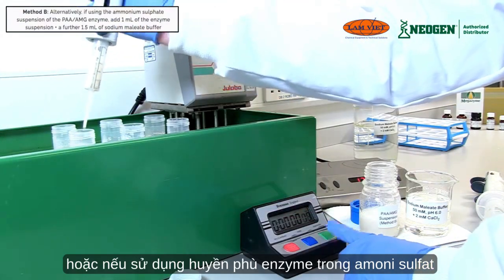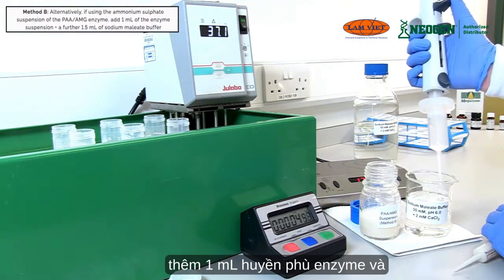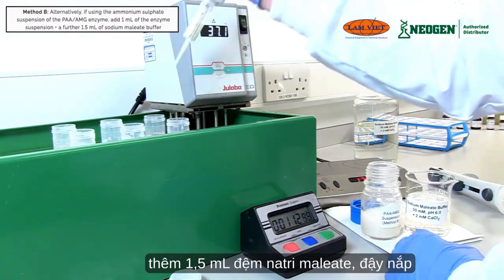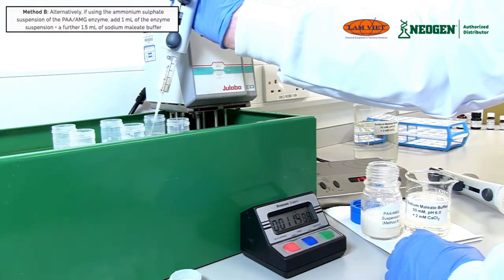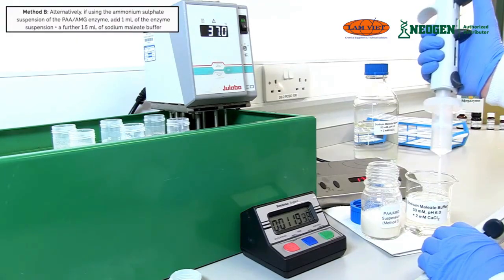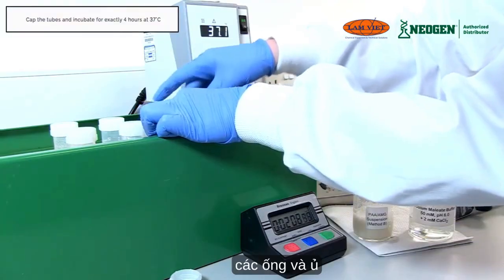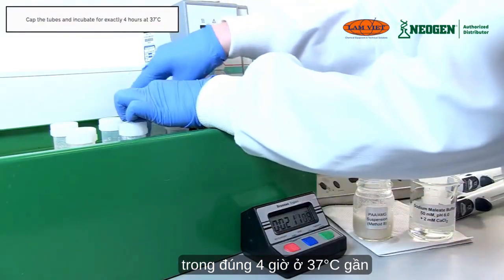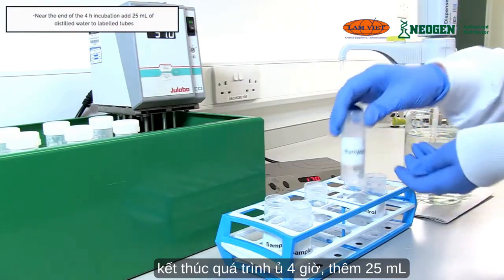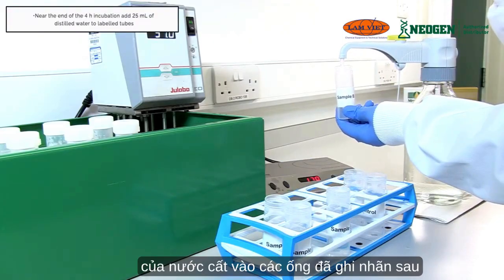Alternatively, if using an ammonium sulfate suspension of the enzyme, add 1 ml of enzyme suspension and a further 1.5 ml of sodium maleate buffer. Cap the tubes and incubate for exactly 4 hours at 37 degrees Celsius. Near the end of the 4-hour incubation, add 25 ml of distilled water to labelled tubes.